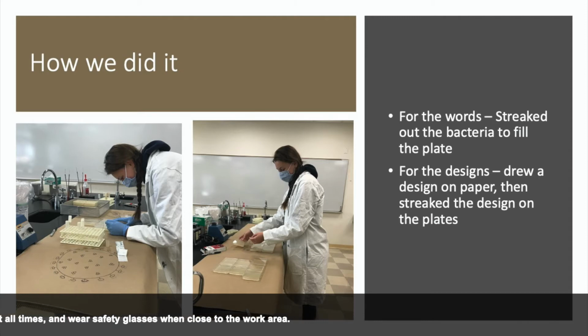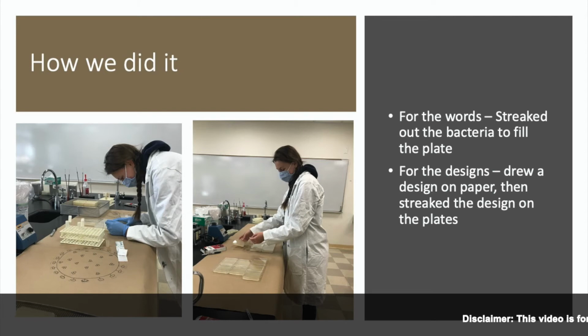Then to make the letters, we first filled out the whole plate with bacterium. We took a swab and covered the entire plate with our paint, so to say.